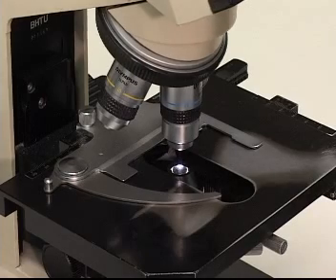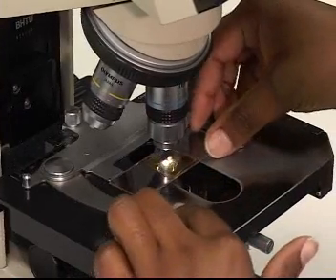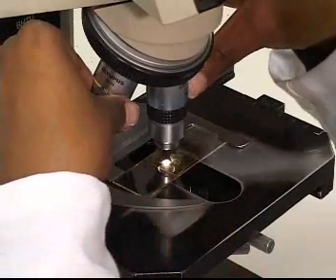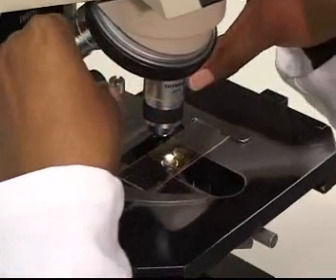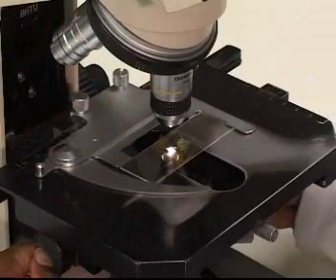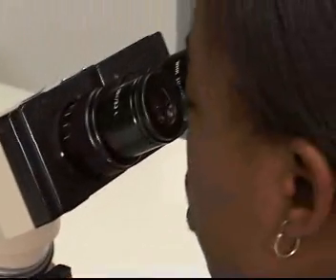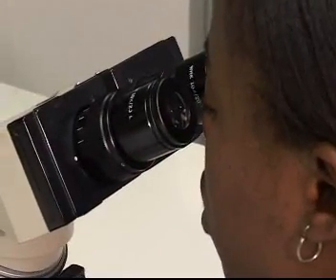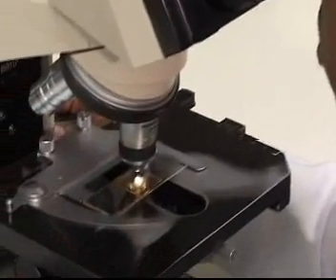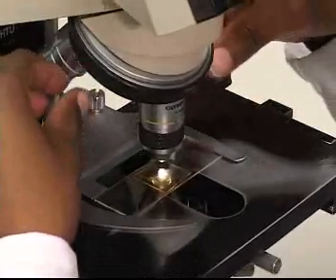You are now ready to examine the slide under the low power and then under the middle power objective. Notice how the nucleus and cell walls are deeply stained. This is because iodine is highly absorbed by the nuclear material and cell walls. Also, there is a chemical reaction between the nuclear material, the cell walls, and the dye.